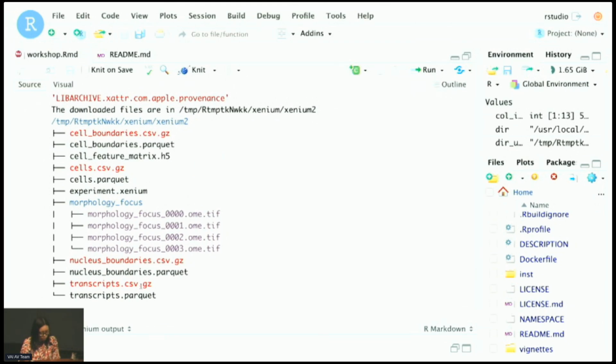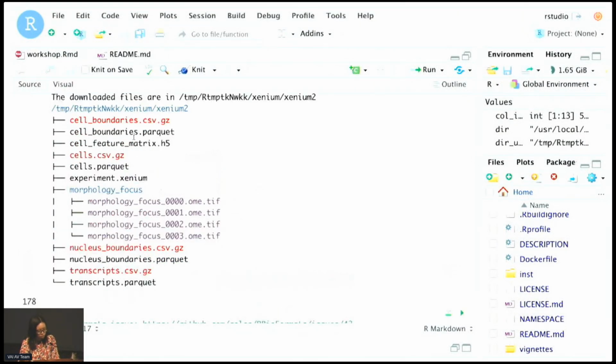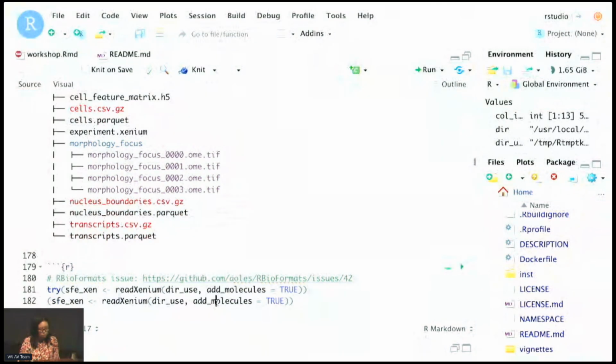So we have cell and nuclei segmentation, but here, although we have the Parquet file, it's actually not GeoParquet, and internally it's just the X and Y coordinates of the polygons. We have the gene count matrix and the cell metadata, and also we have the transcript spots. But here the Parquet file is not GeoParquet, so as a result, the readXenium function would process those and convert those into GeoParquet. And for images, for XOA V2, there are 4 channels, and it's in the OME-TIFF format. So it's from the Open Microscopy project.